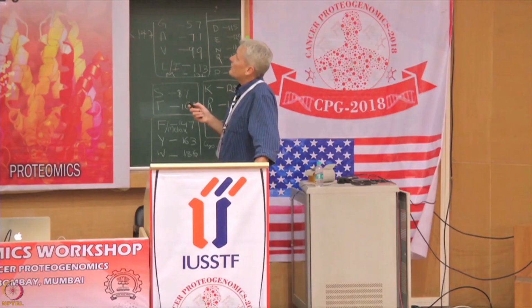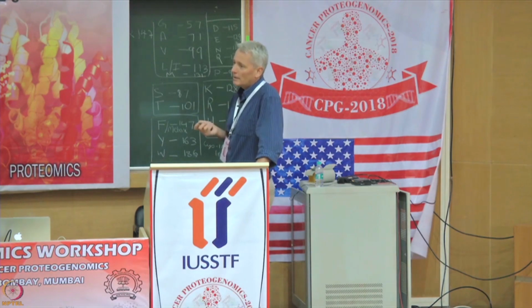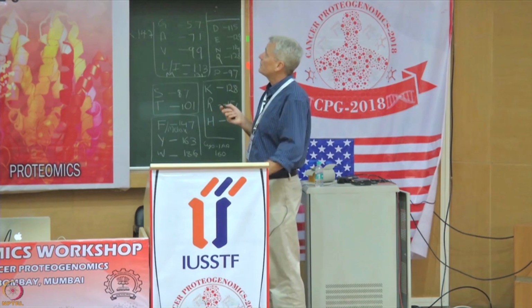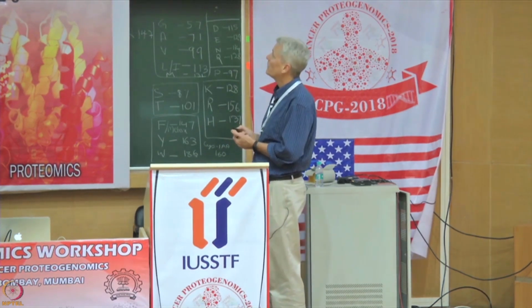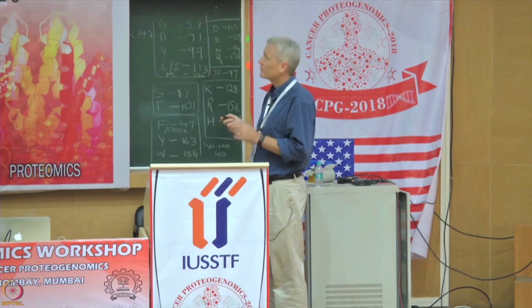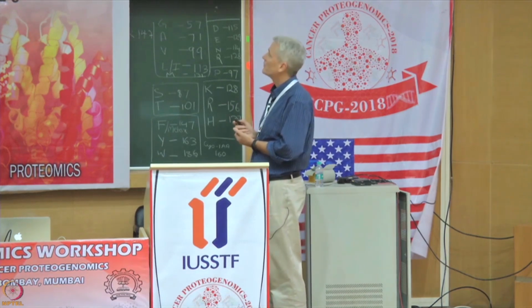You might think that this number is pretty small compared to the 500,000. Yeah, you may well be right. It may be a function of the quality criteria that were applied here. But it's a very rare mass spec experiment, or set of experiments, that can see 100,000 different peptides from human.